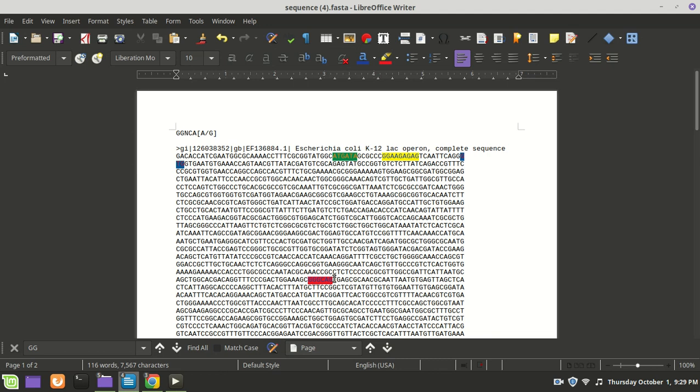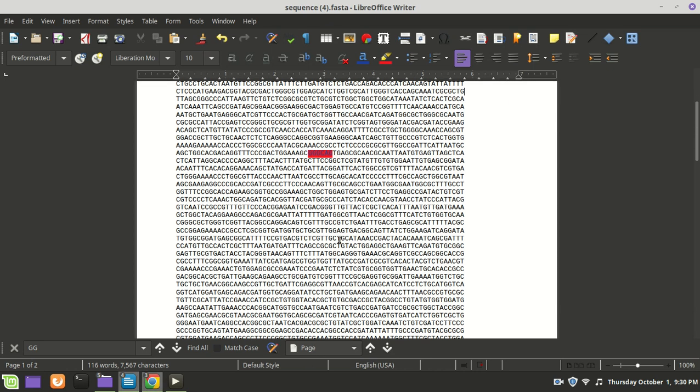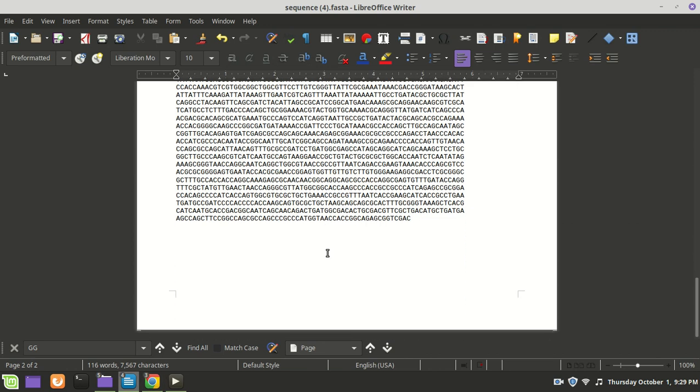The GenBank file will let you find the starts and stops by counting the letters in this file. The GenBank goes along with this FASTA. So that's why it said it starts at 70 and goes to whatever this number was, and that's how we did it. So you can go find Z, Y, and A in this sequence.